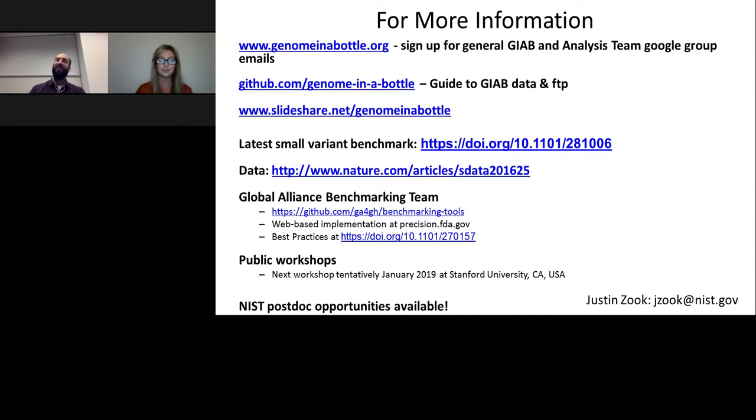But we have started a number of discussions with groups that are looking at characterizing variants in difficult to map regions using linked reads or using long read information and using phasing information. And so there are a number of methods under active development from several different groups that show a lot of promise in characterizing these regions.